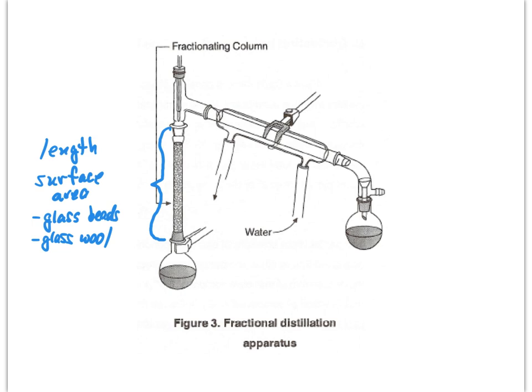So in this fractionating column, what happens is, as we heat our round bottom flask, and we'll talk about how we use a heating mantle, so this is our heat source, as we heat this, it boils and starts up the column, but it hits the cool material and it starts to run back down.